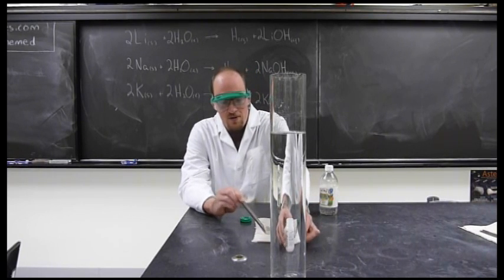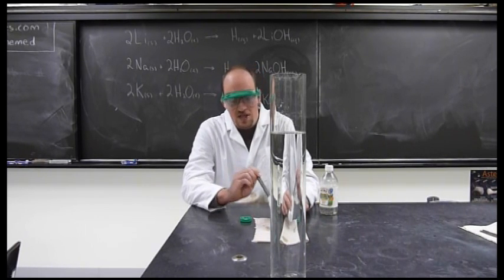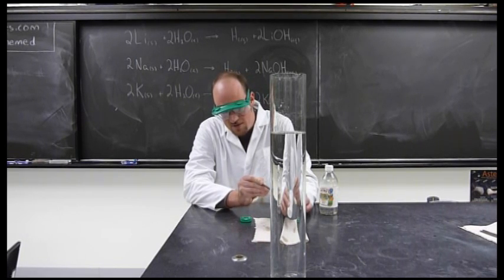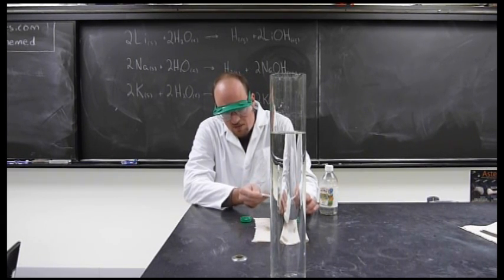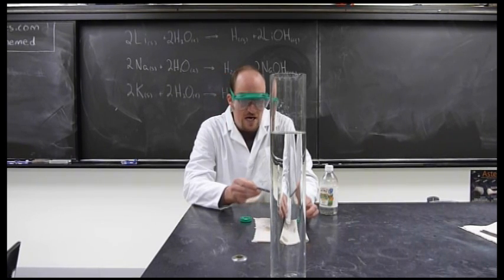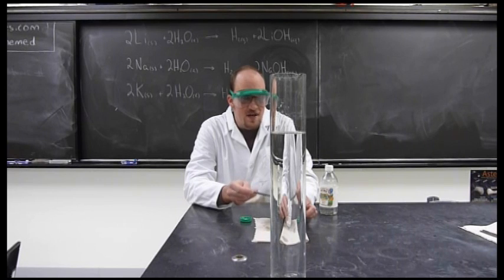The reason this is important is because the chemical change produces a hydroxide. The hydroxide changes the pH of the solution. So you'll be able to see, when I put this piece of potassium into the water, how that chemical change affects the entire system.